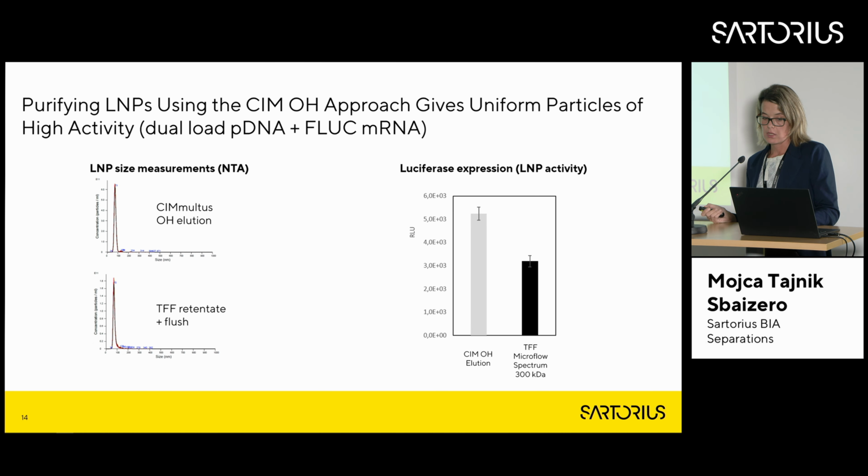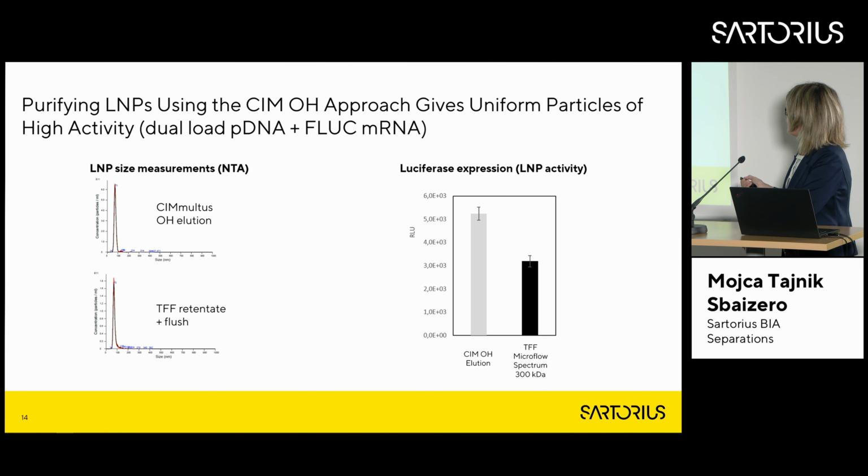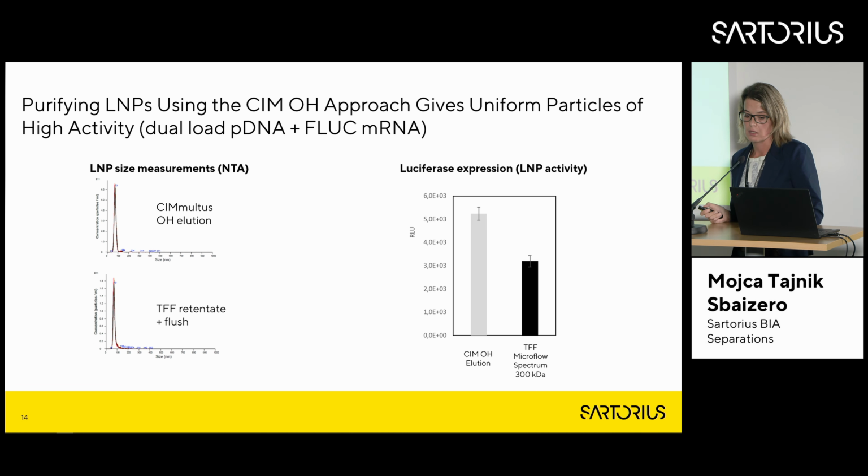When we use dual loading, these samples are also quite challenging for all aspects, starting from encapsulation. In this case, we encapsulate pDNA and luciferase mRNA into the LNP at the same time. We see comparable particle size distribution. In both cases we got, let's say, very nice LNPs, but higher activity in the OH elution compared to the hollow fiber TFF filters.